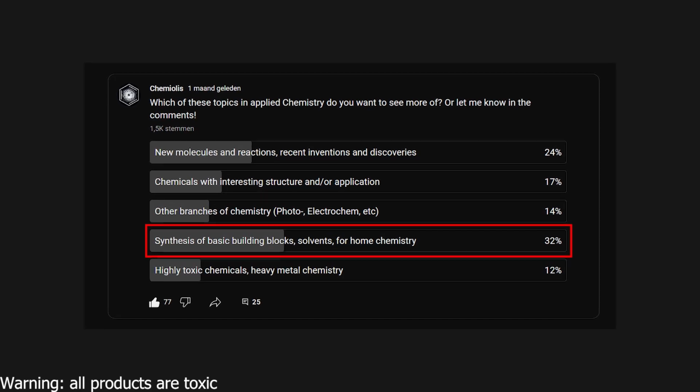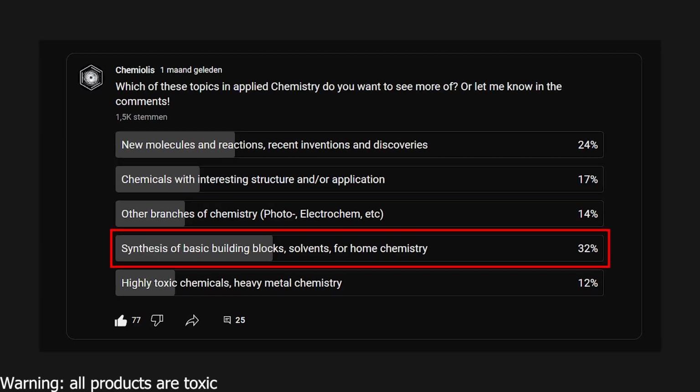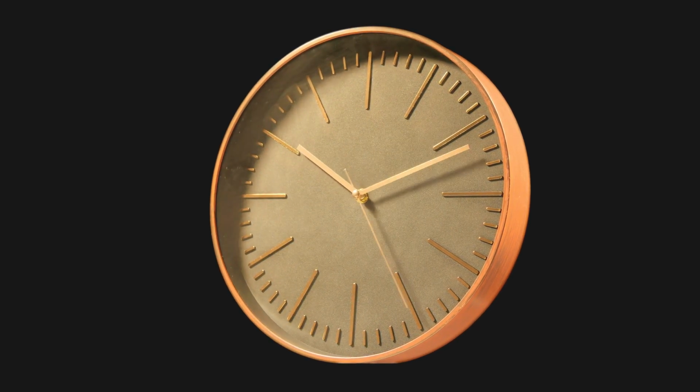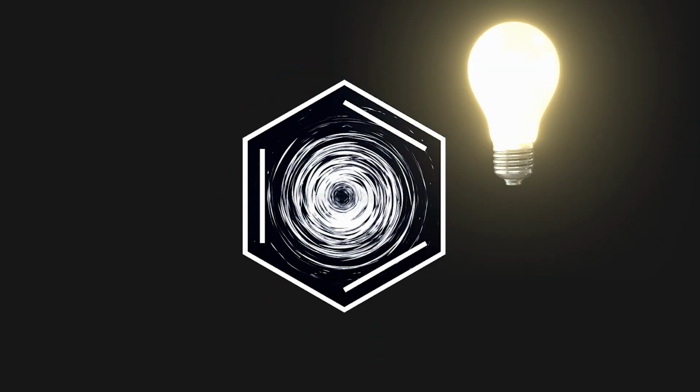So in a poll I held a while ago, the majority wanted a video that is suitable for home chemistry and something you can do in your own little caves. So some time has passed, I channeled my inner nerd rage and came up with something that hasn't been done before on YouTube and only requires chemicals which most home chemists can get.